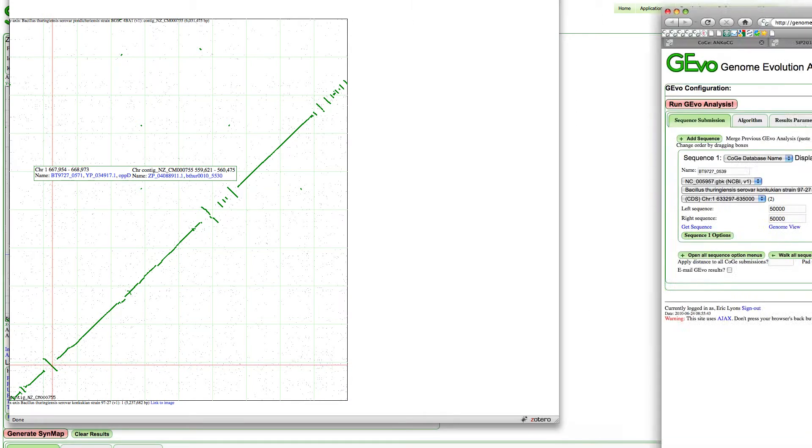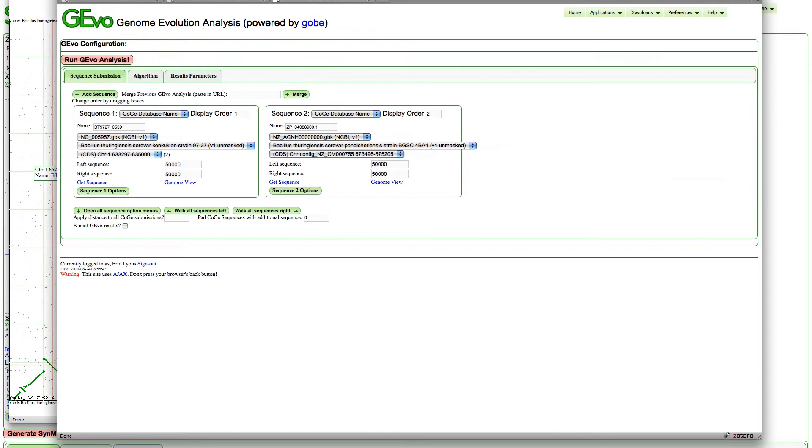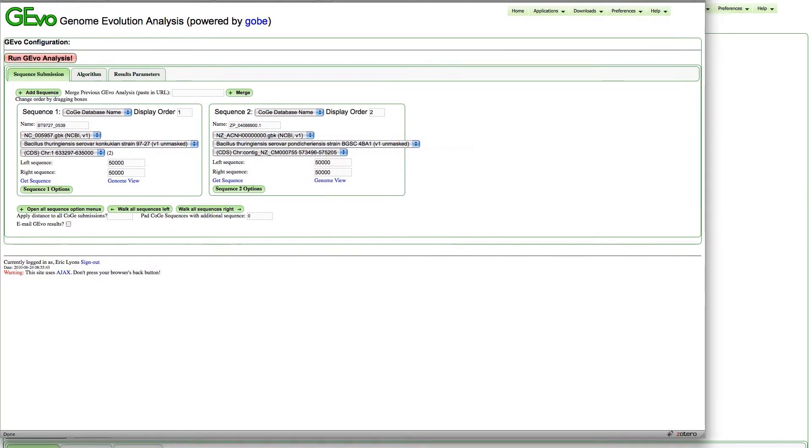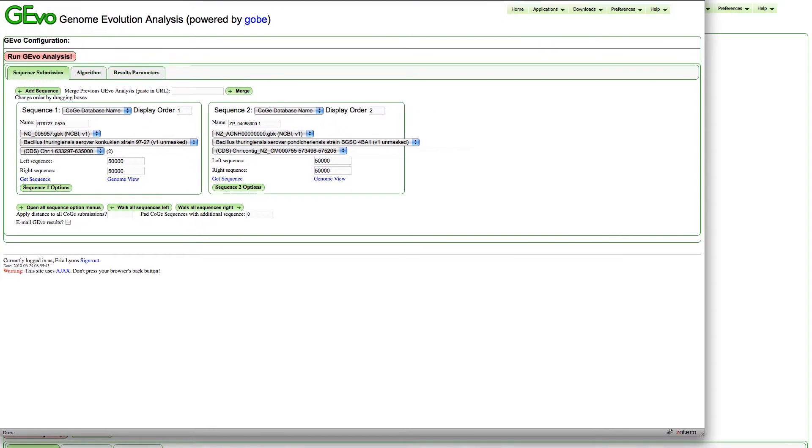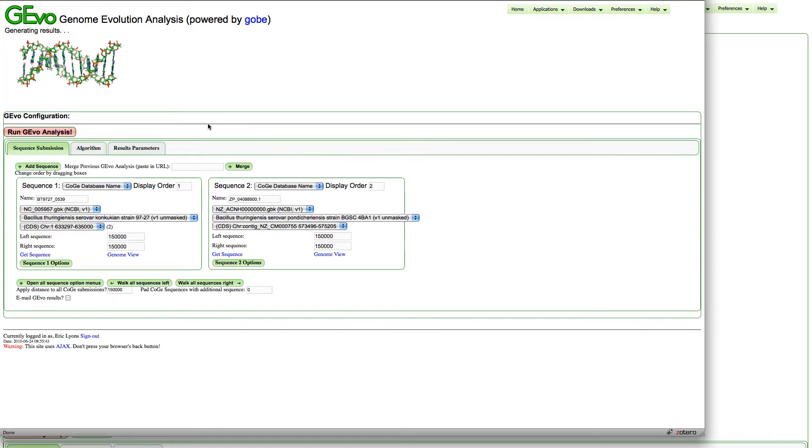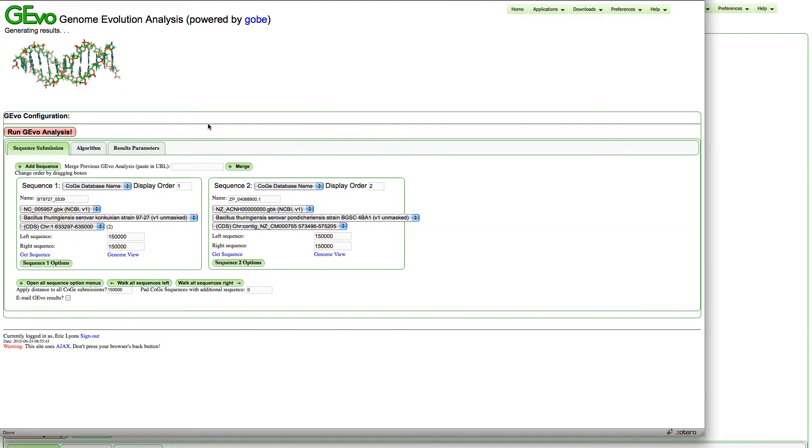GEvo opened in a different window. I want to analyze the entire region, so I'm going to increase the size to 150,000 nucleotides upstream and downstream from these anchor points, and then run the analysis.